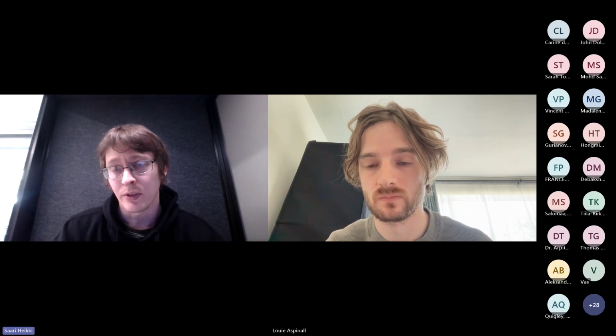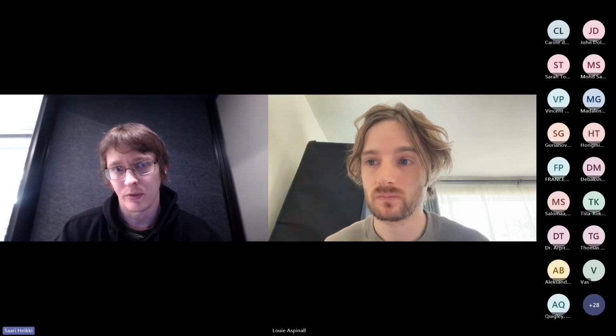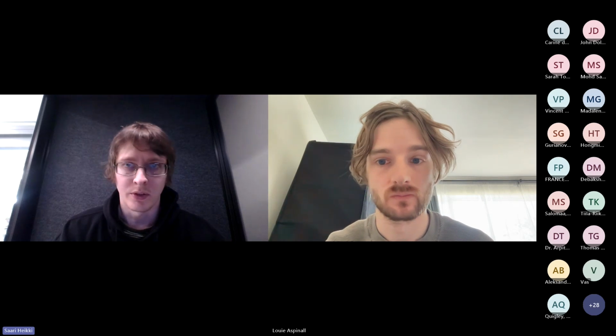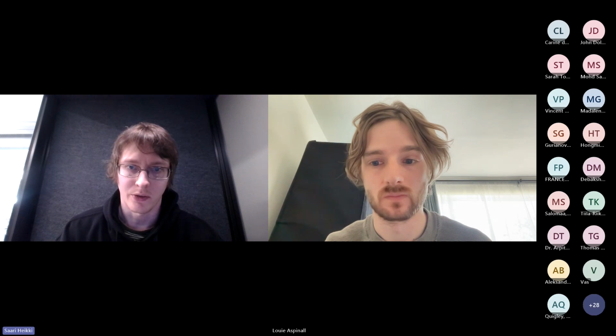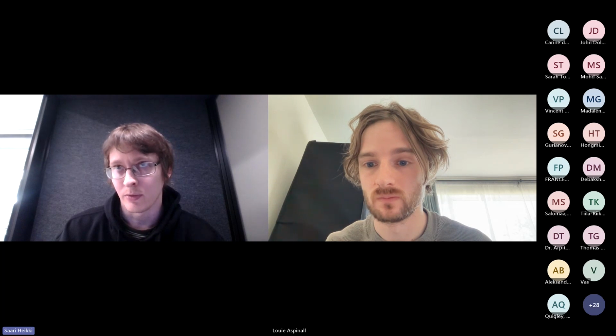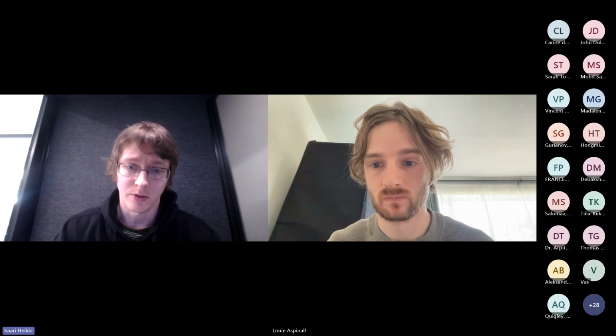The negative I find is that it seems to also bind EVs to some extent. If you load a lot of EVs, you can see that the column kind of gets saturated at some point, and after that you get really good yields. So if you have very dilute samples, I might not recommend this column, but if you don't mind losing a little bit, it's a very nice technique. Cool. All right, thanks again.